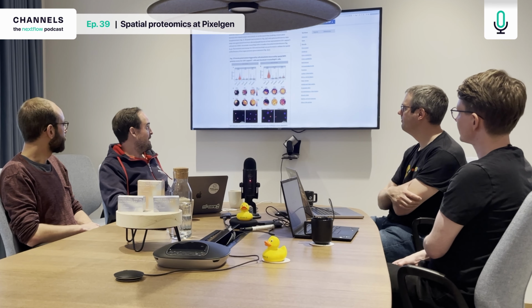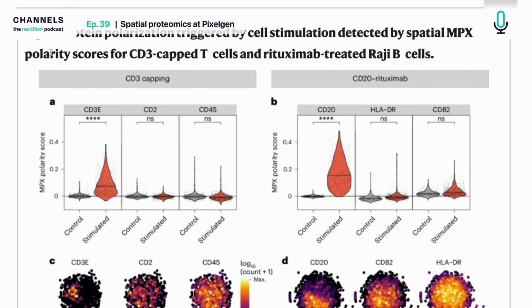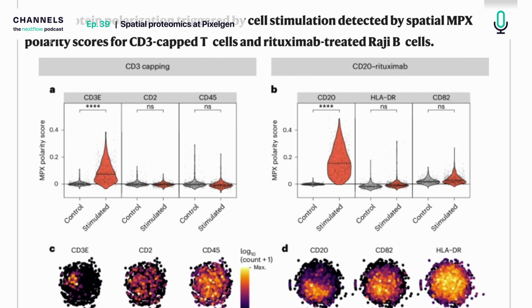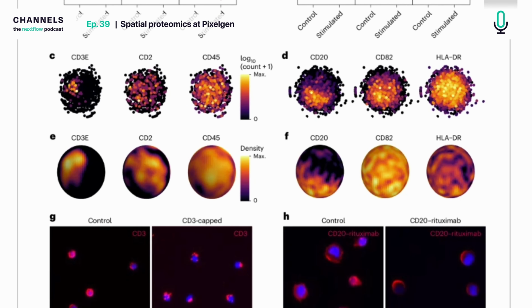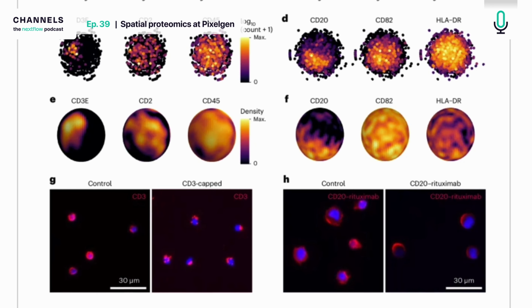And another one which is very interesting here is where the power of the technology is, which is doing this type of polarity studies, how the receptors are going to relocate themselves when you are applying stimuli to the cell. And this is pretty interesting. So actually, you can look at two levels. You can look at the graph level, and you can see this kind of heat map, and then you can try to infer a unit sphere where you are distributing all the counts into the same sort of heat map, and it looks very microscopy-like.